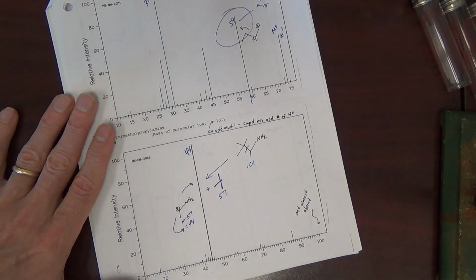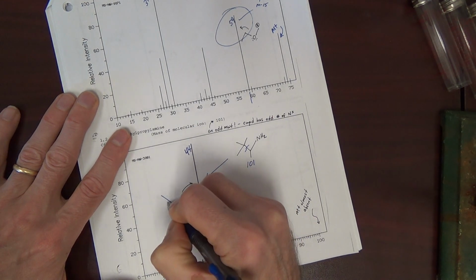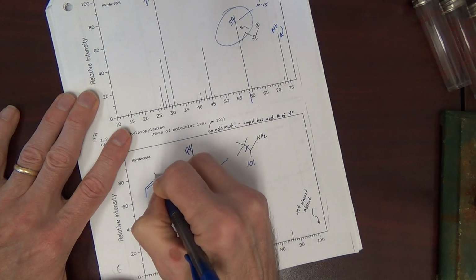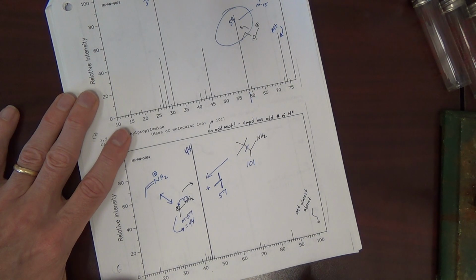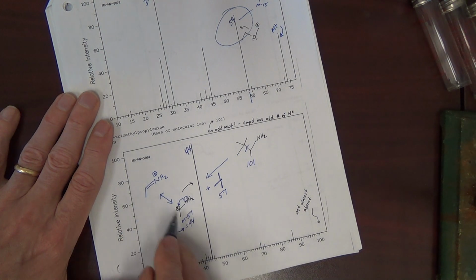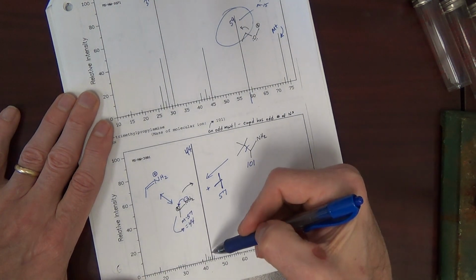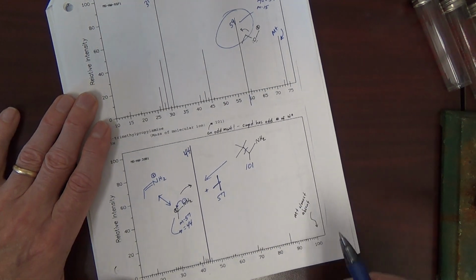Why is this a good place to cleave? Well, it's resonance stabilized. And we can draw a resonance structure as such, and because the cation is resonance delocalized, it's resonance stabilized. This is a predominant cleavage pathway, and that's why there was so much current registered at the position of 44 on the detector.